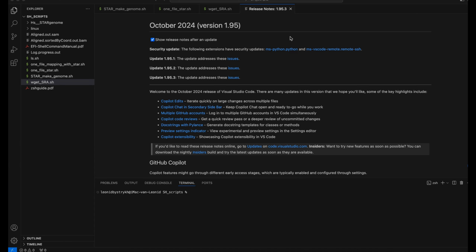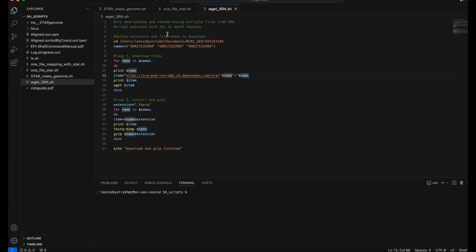It is a universal platform. You can run Python scripts, even R scripts, and obviously shell scripts. I don't want to teach you all the syntaxes and vocabulary of the shell scripts. It is a rather complicated story. I just show you the end product which you can recreate on your computer and use for your own download.